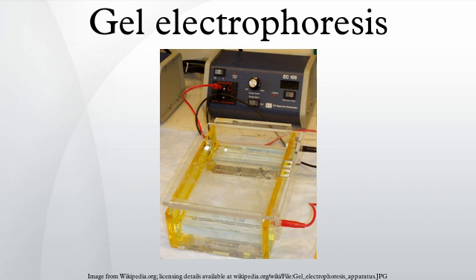Denaturing conditions are necessary for proper estimation of molecular weight of RNA. RNA is able to form more intramolecular interactions than DNA, which may result in change of its electrophoretic mobility. Urea, DMSO and glyoxal are the most often used denaturing agents to disrupt RNA structure. Originally, highly toxic methylmercury hydroxide was often used in denaturing RNA electrophoresis, but it may be the method of choice for some samples. Denaturing gel electrophoresis is used in the DNA and RNA banding pattern-based methods DGGE, TGGE, and TTGE.